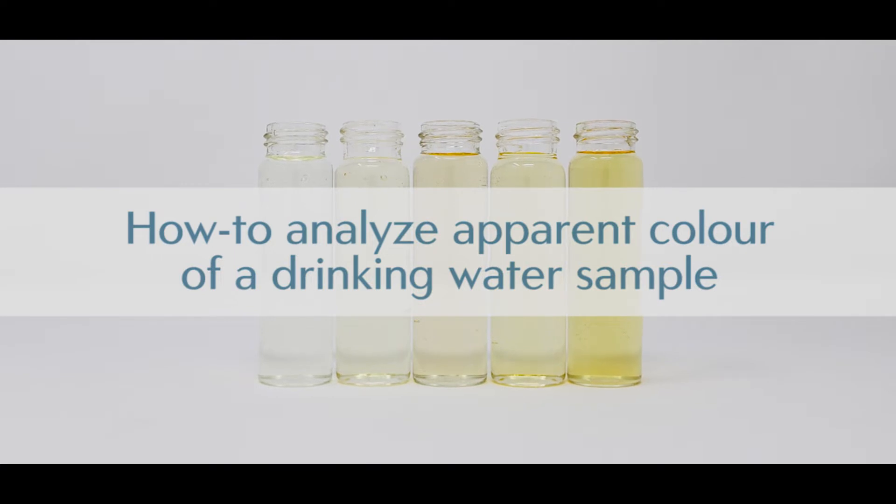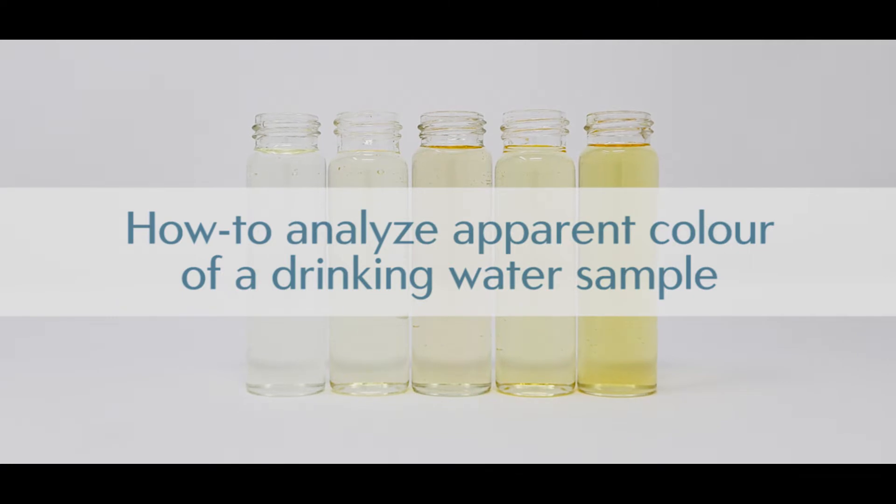This video will demonstrate how to properly analyze the apparent color of a water sample by the platinum-cobalt standard method.